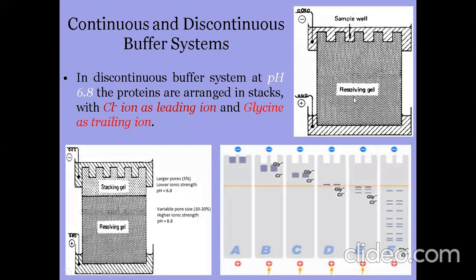And in this one, the whole of the gel is resolving gel. We do not divide it into two parts. Here, stacking and resolving are two different components of the gel. Am I clear up till now?